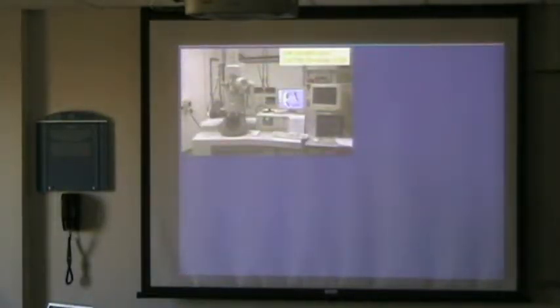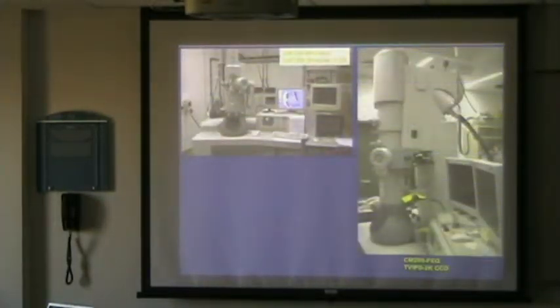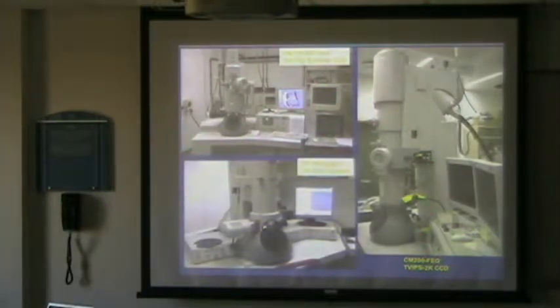These are just a few examples. I don't know whether you have ever seen an electron microscope. That's the cheapest kind you can buy at the moment. That's a regular routine microscope, I would say, with pretty good quality. They're actually not exactly the newest anymore, in case you have looked at newer ones. But the principle is, of course, still the same. We have the gun up here. This is an FEG gun in this case. This is a regular gun.